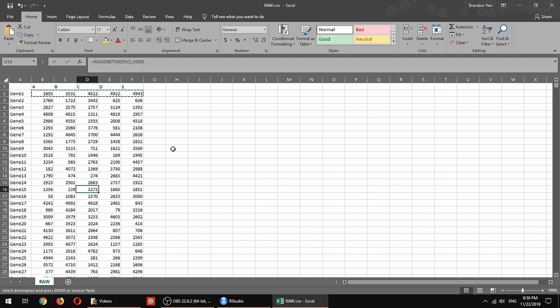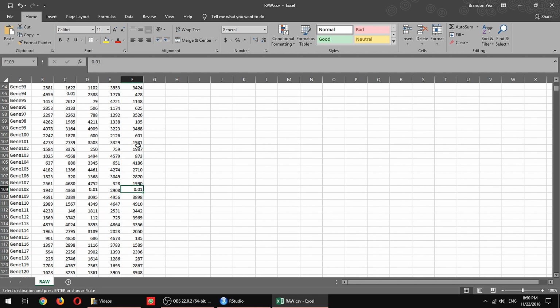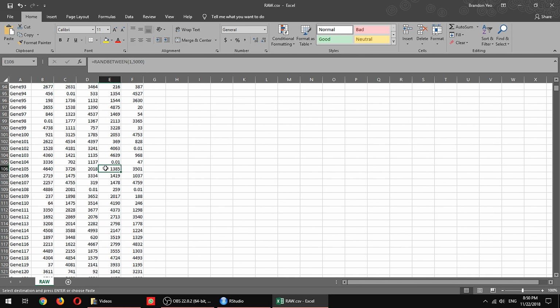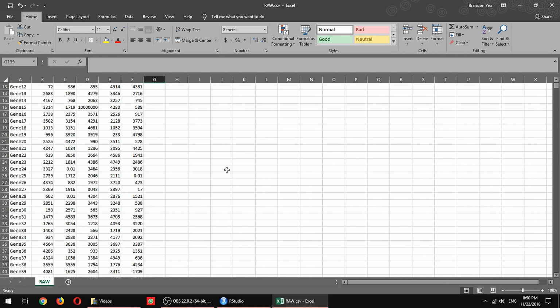In gene expression data, genes will never be that even. One of the values might be super big, let's say 10 million, and there might be a few of them. It's very common for RNA-Seq data to have something ridiculously big and something ridiculously small, let's say 0.01. Your statistical test, if you are using, let's say, a DEG analysis before this, might be able to fish all these out, or they might amplify them because the changes between samples are so big. So usually in the RNA-Seq workflow, you have a lot of weird data inside your plots.